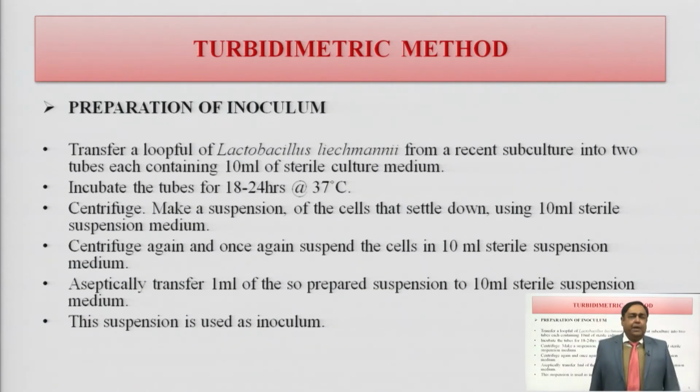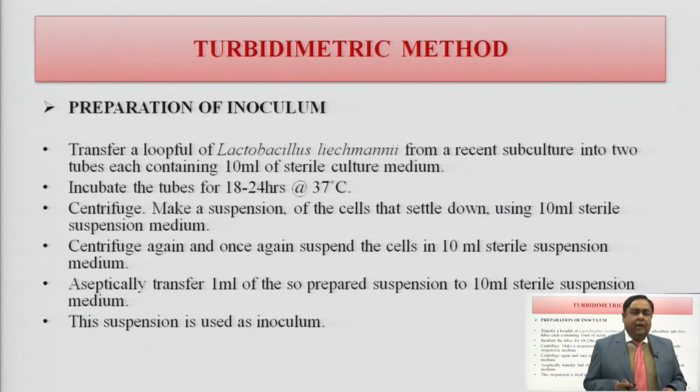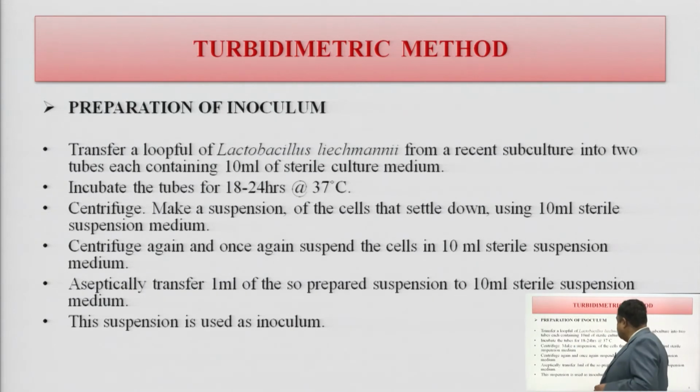So, we have to prepare an inoculum. Inoculum means we have to prepare a sterile culture media where this Lactobacillus leichmannii should be growing, and we have to make repeated subculturing, keeping the temperature at 37 degrees Celsius, and generally the time is 18 to 24 hours.